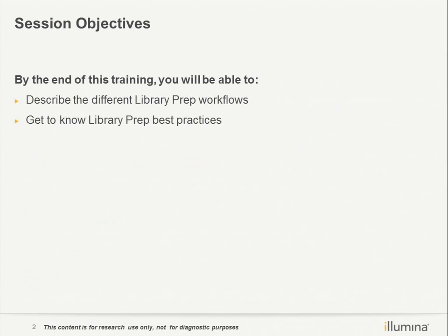And after this training session, you will be able to describe the different library prep workflows from DNA, RNA targets, and some epigenetics libraries. And you will get to know the library prep best practices.